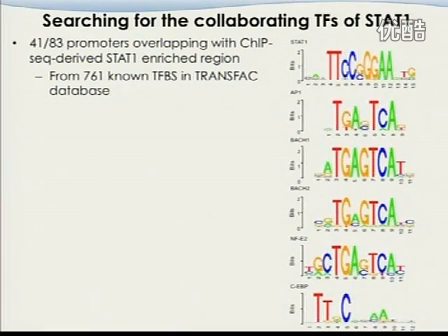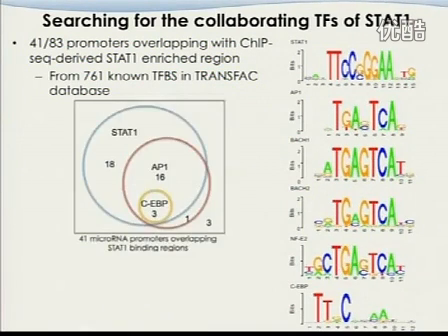And that really suggested one of them is real. The others may be artifacts. So we think AP1 is real at this stage. I'm not going to tell you what's the reason for that. But another thing that we look at is, among all these ones that have the STAT1 binding sites, we had detected 37 of those. And 19 have AP1 binding sites in those regions as well.